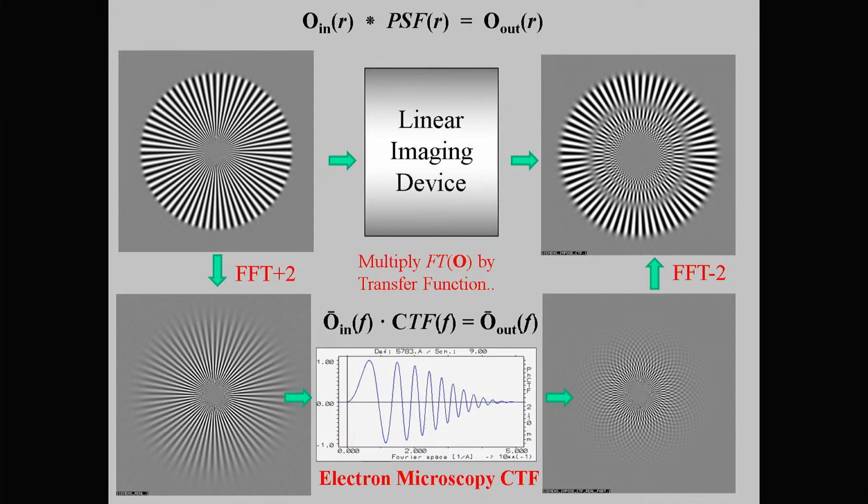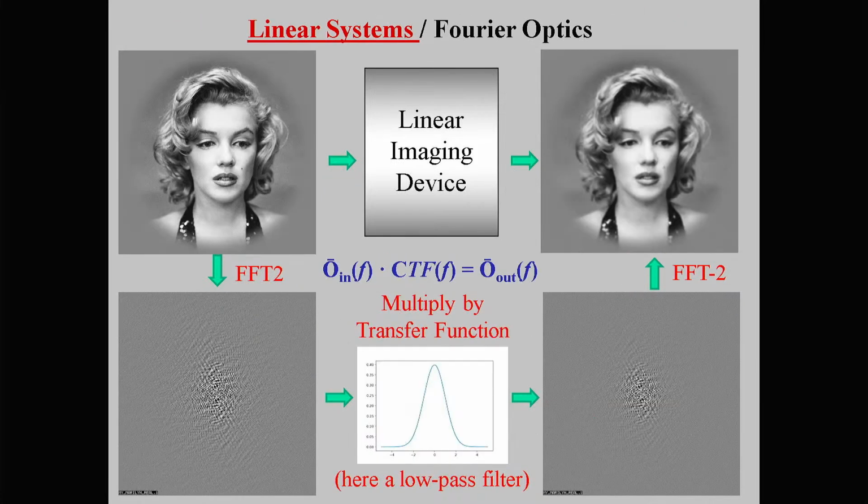What this means also, and that's a little bit tricky, because this is a deterministic mathematical function, is that you can go both ways. If you know the image with absolute precision, and you have the properties of the imaging with absolute precision, you can calculate the object. And that's a bit weird, for a number of reasons. These are analytical functions, and the question is, are my functions analytical? No way. Here we have linear systems.